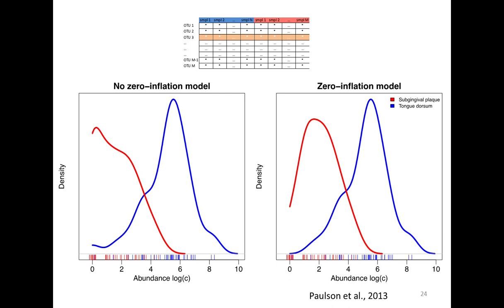For a graphical explanation, here, if you look at one particular row, I'm presenting Granulicatella paradiacens from subgingival plaque and tongue dorsum. On the left, we have kernel density estimates. If you look at the red, it's subgingival plaque. If you look at the blue, we have tongue. We see a difference between the two groups, right? This particular bacteria is more abundant in the tongue. So without accounting for the sequencing depth on the left, we see that there's a large difference.